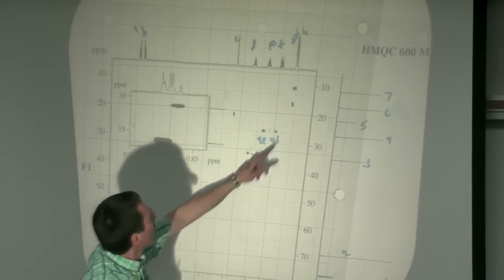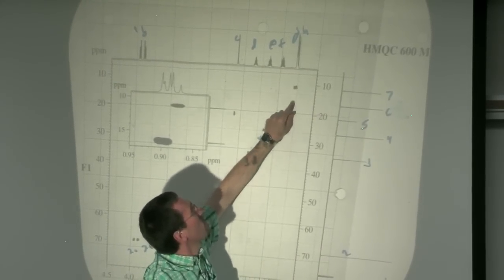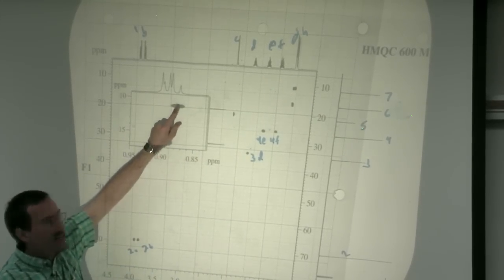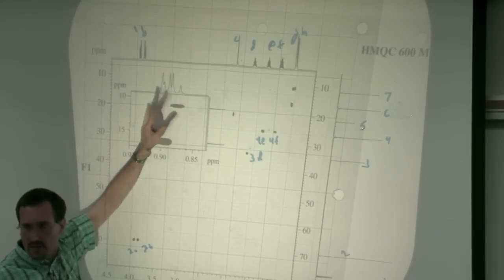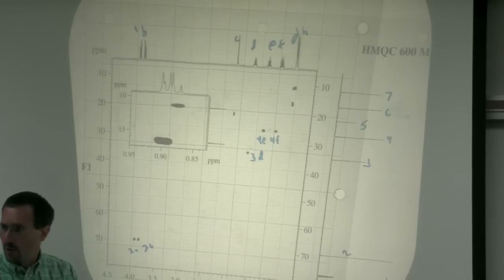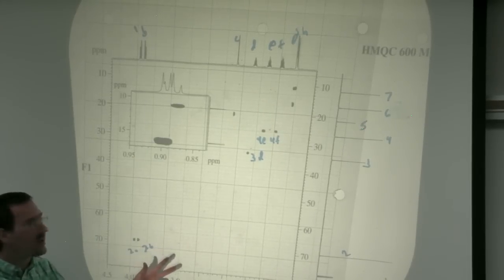And you can see one cross peak lines up kind of centered with H, the other cross peak lines up with G. They've included an expansion here. I believe they have actually forged their data here. I think this cross peak actually should be spread out, and they were trying to make it easy for students by showing it just under here. But again, what good is that going to do for you when you encounter your own real data and you say, oh, it doesn't look like it looked in the problem?